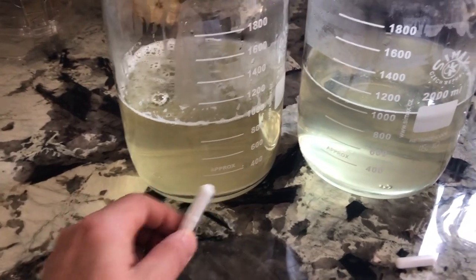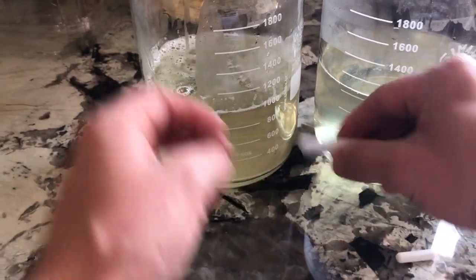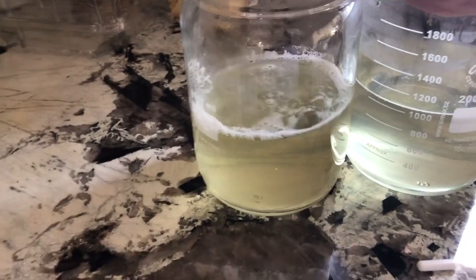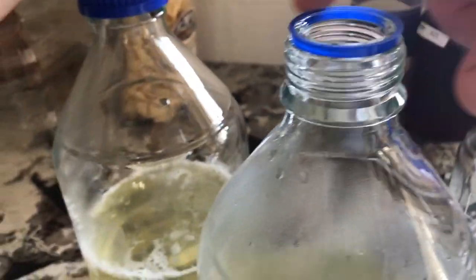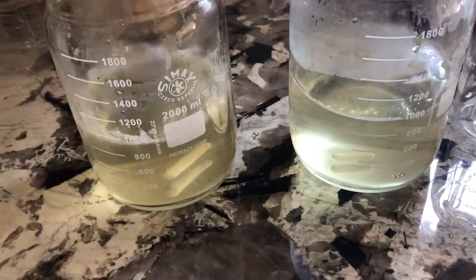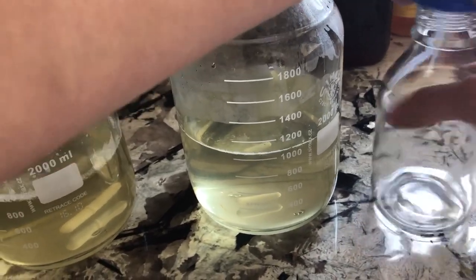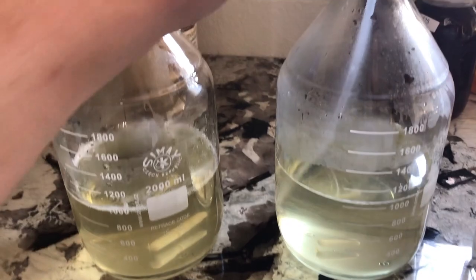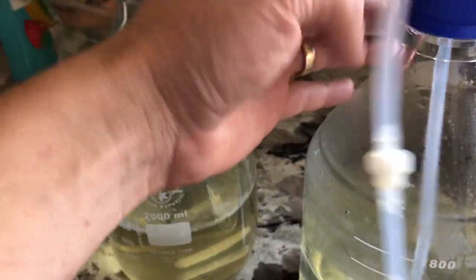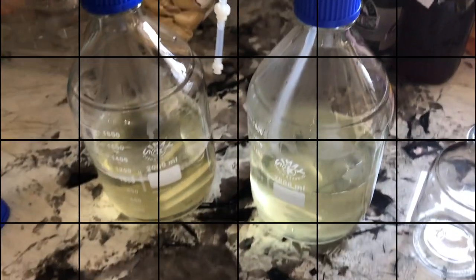All right, guys, so you can see I've got 2 liters of liquid culture ready, and I'm going to add these stir bars to the media bottles. These are important so that you can mix your liquid culture without stirring or without shaking. They're not completely necessary, especially with these bottles that have this media ring right here. So it's not necessary, it's just a convenience. And then I'm gonna go ahead and exchange the lids here, since I'm not gonna be using this smaller bottle, just to show you guys how easy it is to switch that over to a 2-liter media bottle. So I'm just using this same lid here.